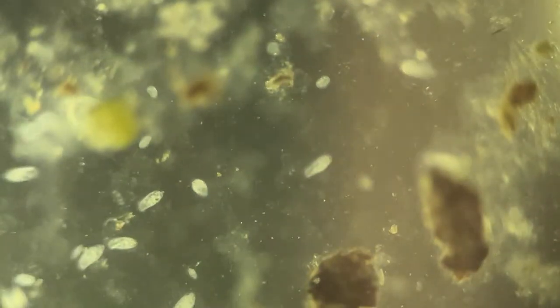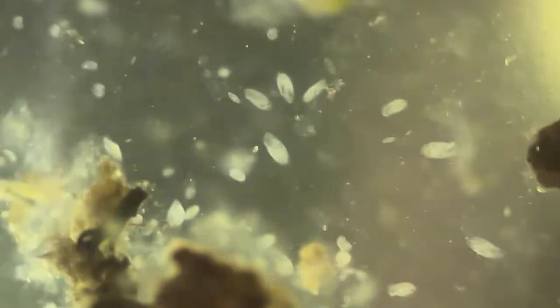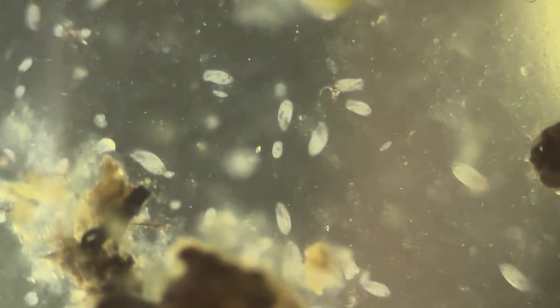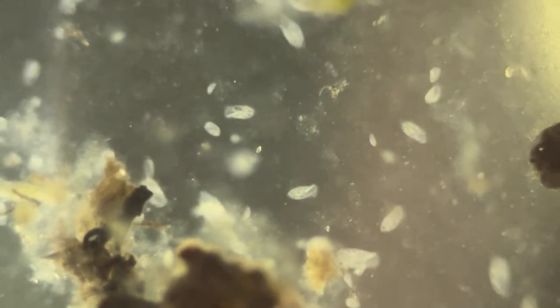And now we start searching for the first. Okay, now let me show you, there was a tick here. Presently, let me bring the focus to 4x. You see the protozoans. Lovely, aren't they? Gelatinous whitish mass.